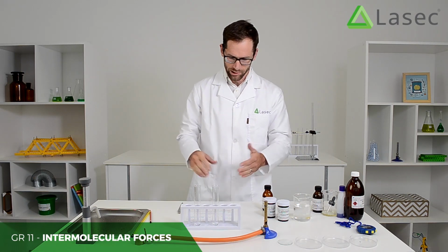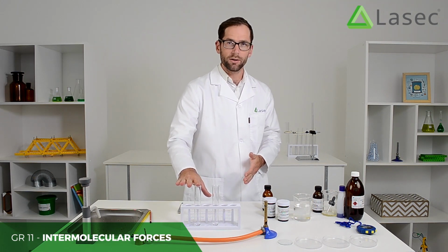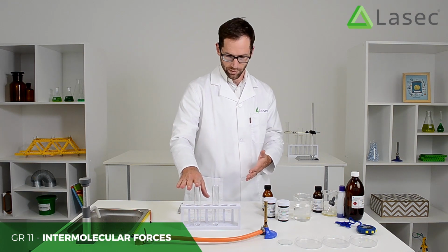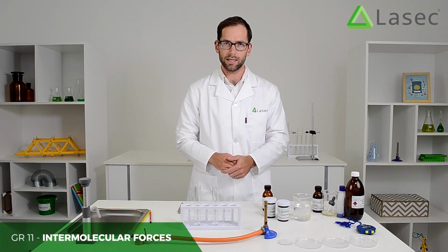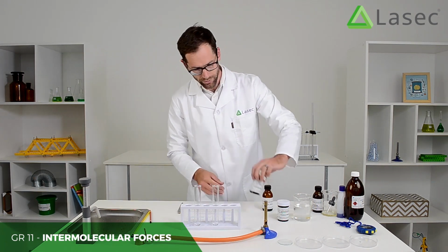Then you're going to check that solubility in water. So I've got 2 mils of water in each of these test tubes. Afterwards, we're going to try that in ethanol. The curriculum also calls for chloroform, but that's a very poisonous substance, so we're not going to use that, and I advise you not to give that out to your kids. So let's start off with the sodium chloride.